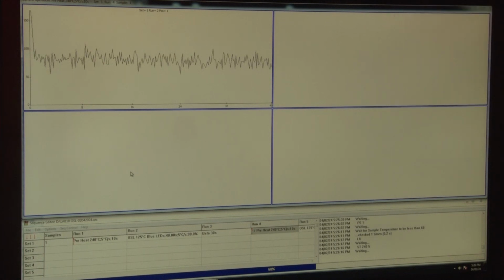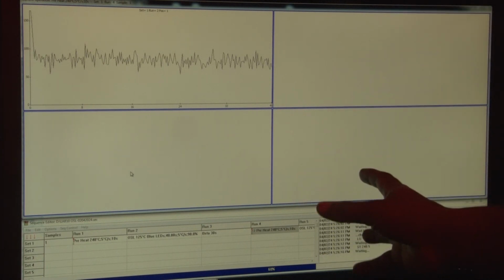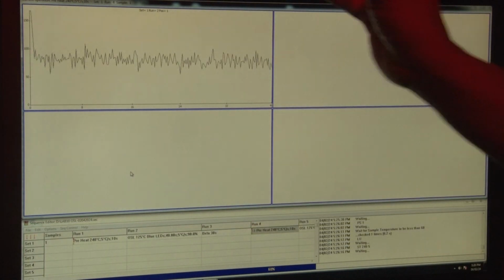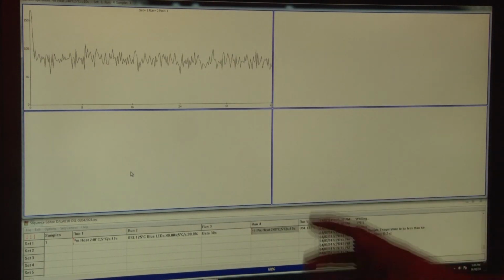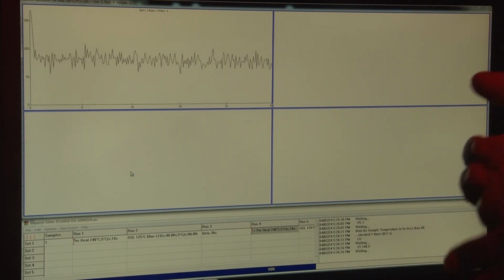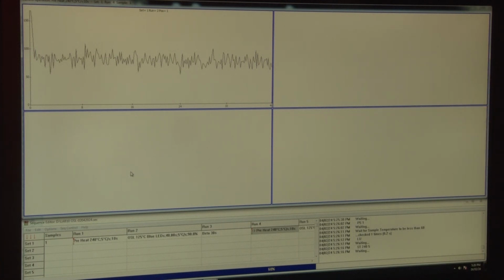Here we are basically trying to regenerate the radiation which has been accumulated in nature. We are trying to regenerate that radiation in the lab. The basic concept of the OSL regenerative part is that the amount of radiation which has been accumulating in nature over kilo-years, we can generate in the laboratory in a few seconds, because we have a strong radiation source. The rate of this radiation source is quite high compared to the natural radiation.